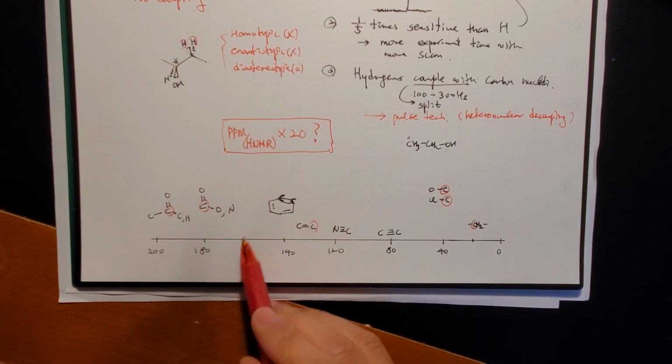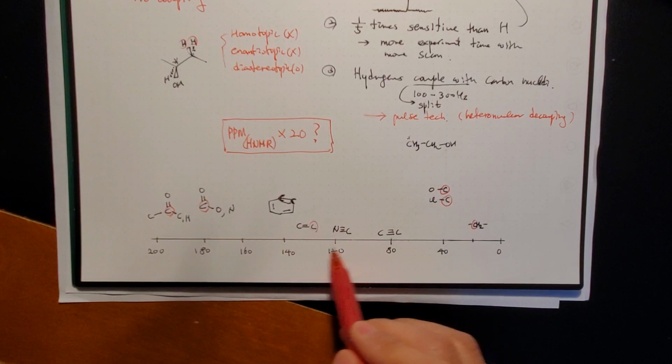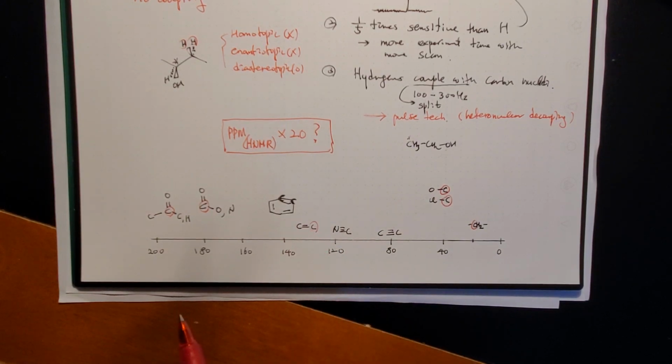Then the higher half is aromatic, the lower half is alkene, not so strictly though. Then carbonyl, something like 170-ish to 200. That's enough. Once you recognize and memorize this, you just have to come up with how many signals you have in the molecule, and then you can connect the functional groups to these, and you're all set.